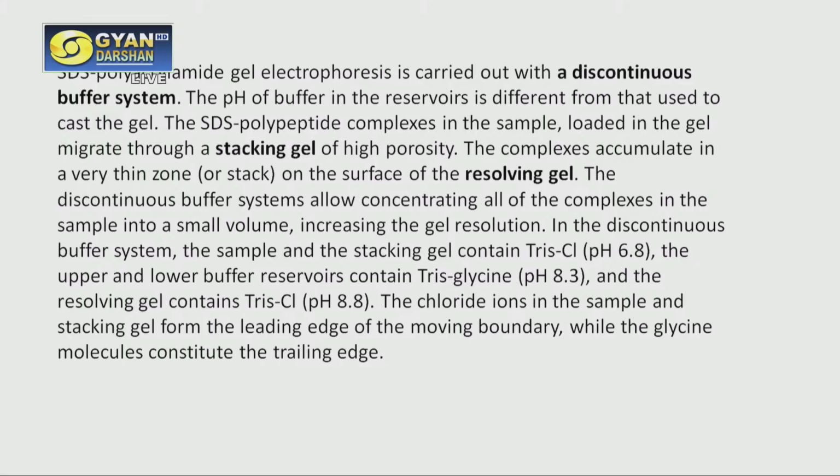The SDS polypeptide complexes loaded in the gel first migrate through a stacking gel. So stacking gel should be at the upper part and resolving gel should be at the lower part. Now the complexes accumulate in a very thin zone on the surface of the resolving gel. This discontinuous buffer system allows concentrating all the complexes into a small volume, increasing the gel resolution.